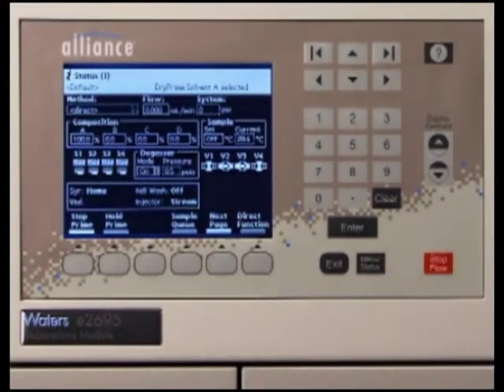The solvent management system begins to operate. At the end of the priming period, the solvent management system turns off, and the Separations module enters the idle mode.